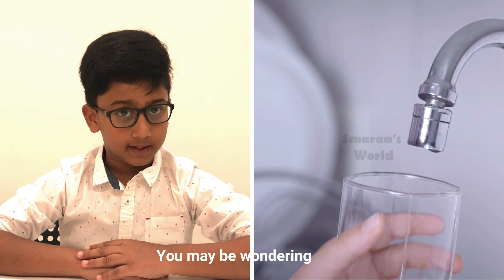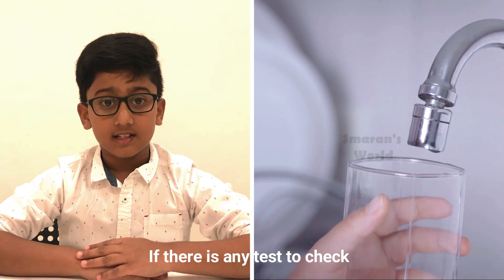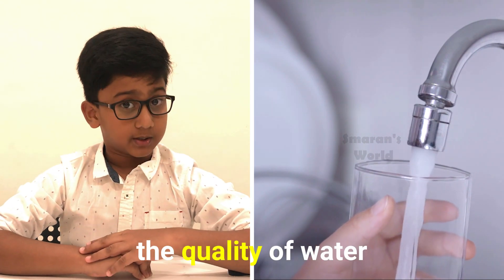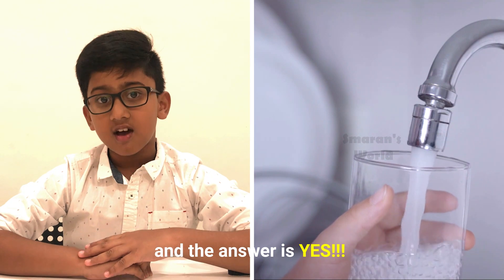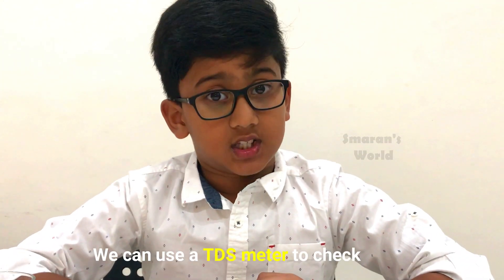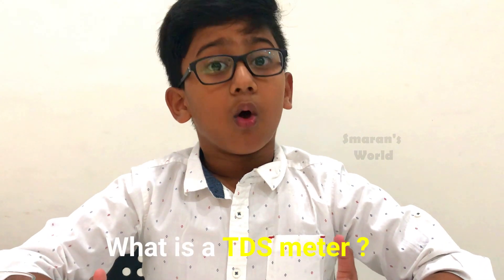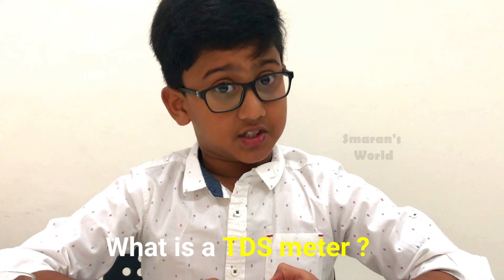You may be wondering if there is any test to check the quality of water. And the answer is yes! We can use a TDS meter to check the quality of water. You may be thinking, what is a TDS meter?